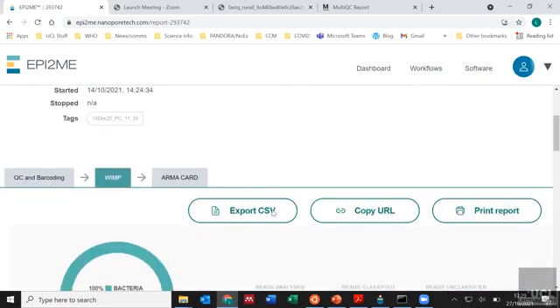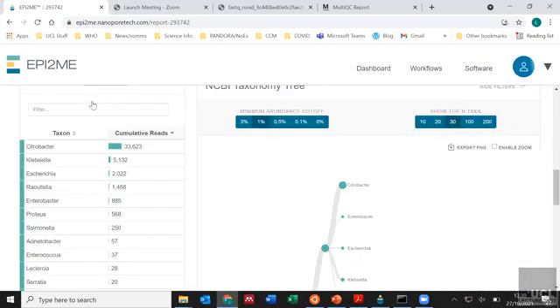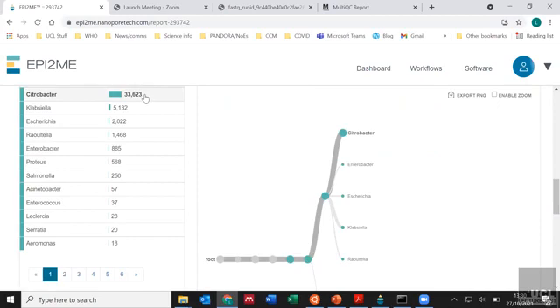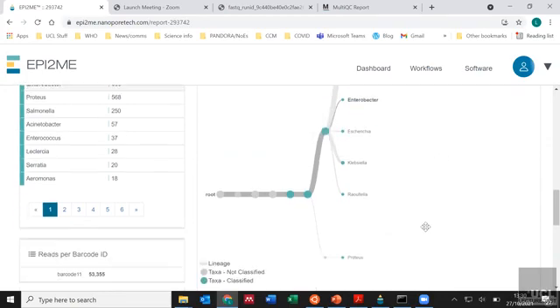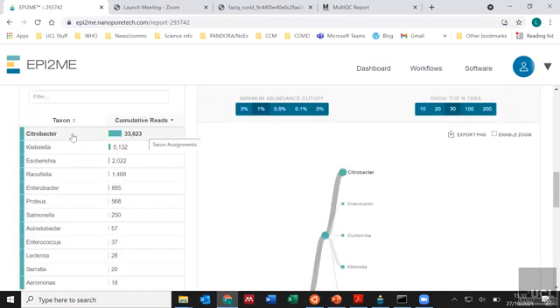With WIMP, what's in my pot? So this was an isolate, so it's saying that the majority of my reads look to be Citrobacter, but obviously if you've just put Fastq files in, especially if they're really short sections, and as I say, this one is native, so I might have a couple of reads that might have been only a few hundred base pairs, it might then decide that some of them might not be Citrobacter and it might think they belong to something else. So if I've got 33,000 reads that it believes belong to Citrobacter, I can be fairly confident that this is a Citrobacter.